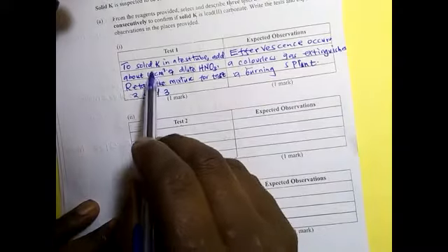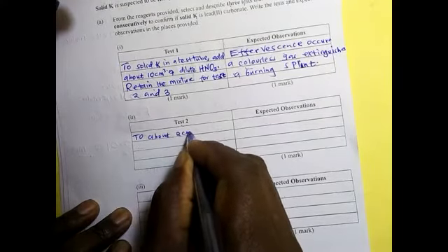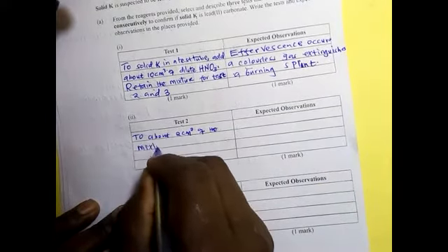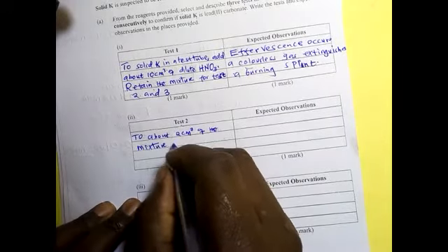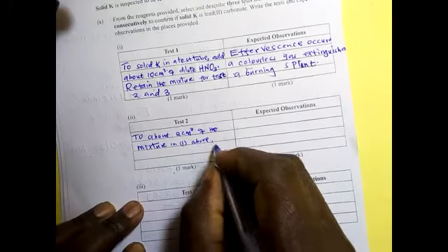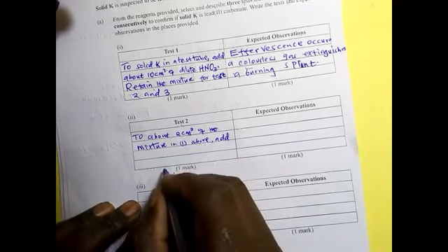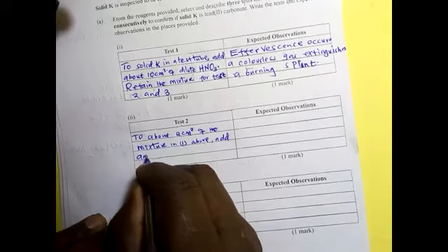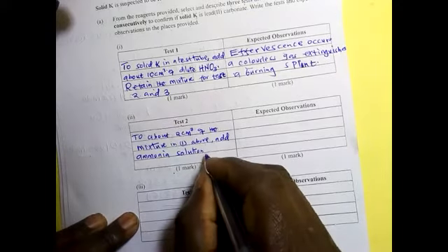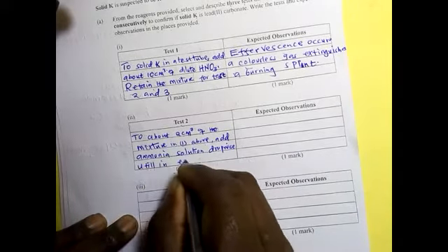Therefore, we now take about 2 centimeters cube of the mixture in Roman 1 above, and add aqueous ammonia solution dropwise until in excess.